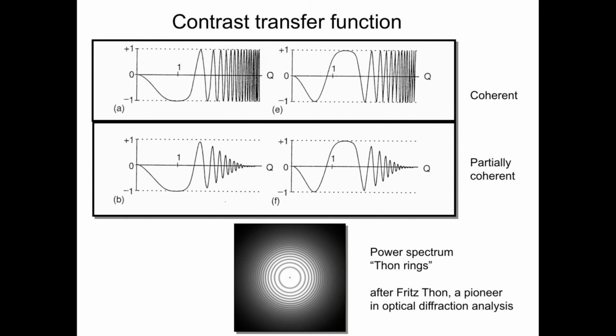Okay, why did we get these? Well, obviously the contrast transfer function goes between positive and negative intervals and has zero crossings. So this one would be negative, positive, negative, positive, and so forth. So alternating. We don't see it because we only see the amplitude of the Fourier transform.